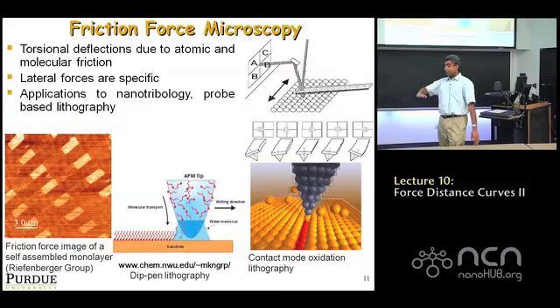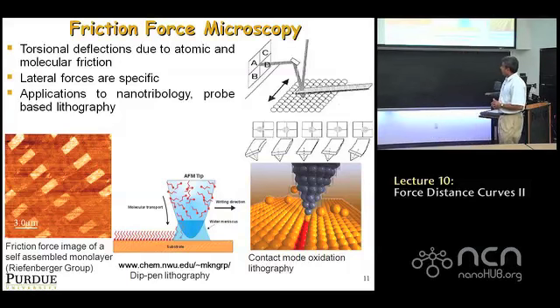So remember, the photodiode effectively measures the bending angle, the angle at the end of the tip, because the location of the spot really changes due to a change in angle of the cantilever. In the same way, when it twists this way, it's the twisting angle that's measured in the photodiode signal. And using that, you can measure some very interesting properties.